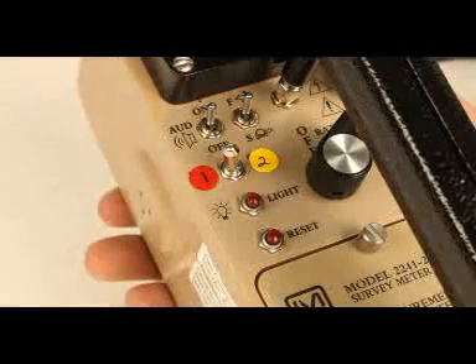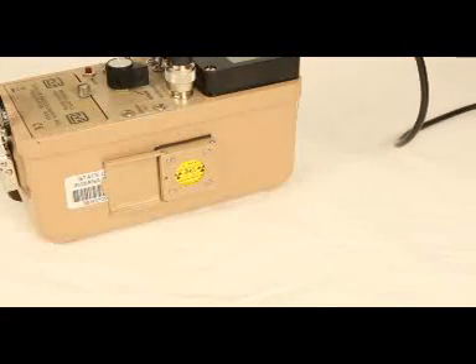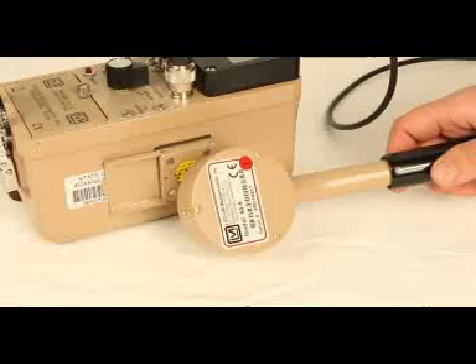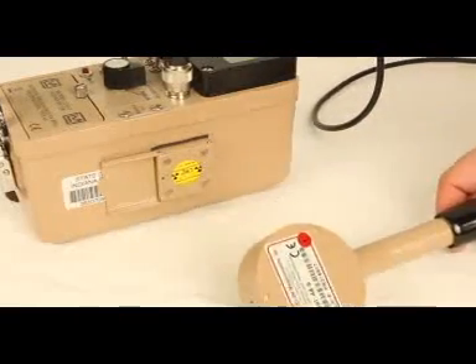Depressing reset will acknowledge the audible rate meter alarm. Depressing reset a second time will reset the rate meter reading and rate meter alarm. Before use, conduct an operational check. Place the probe against a known radiation source if available. If the clicking sound does not increase, do not use the device.